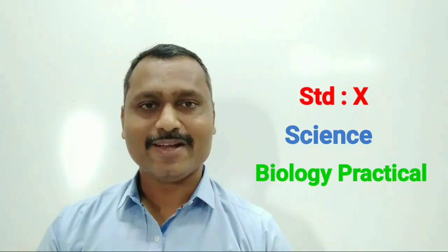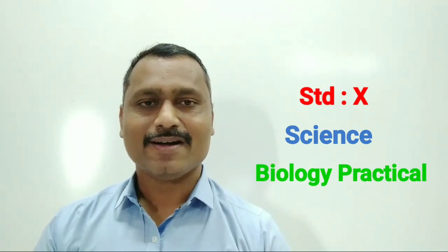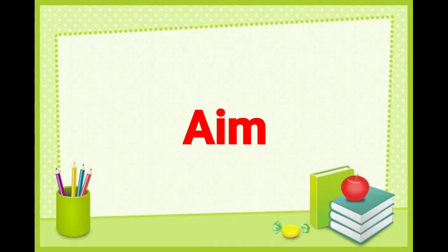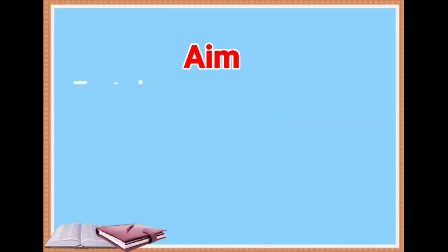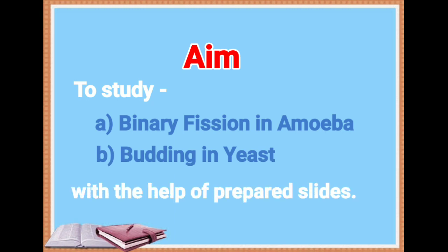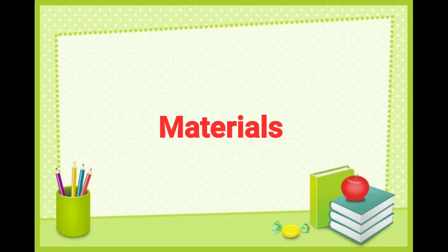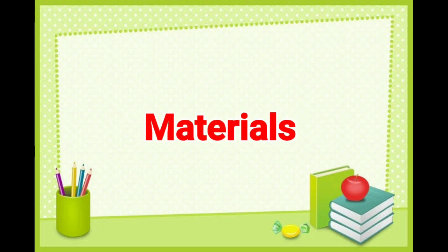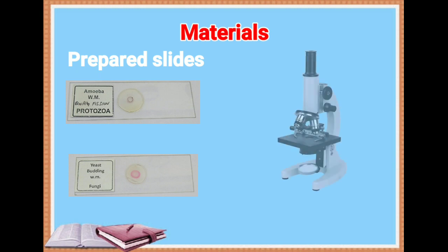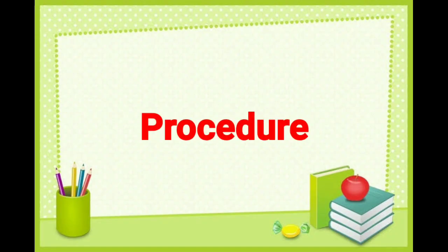Hello dear students, today we are going to perform a practical from biology: binary fission in amoeba and budding in yeast. The aim is to study binary fission in amoeba and budding in yeast with the help of prepared slides. Materials required: prepared slides of binary fission in amoeba and budding in yeast, and a microscope.